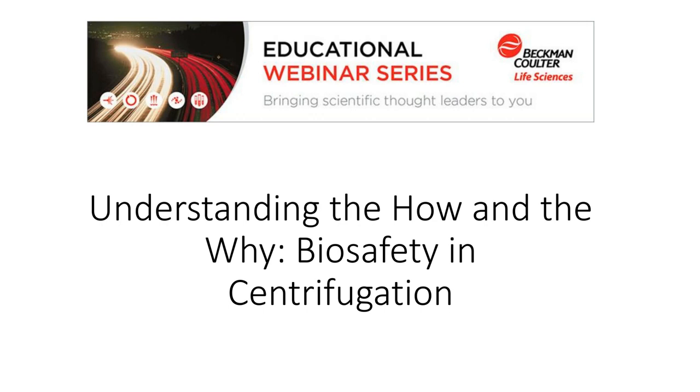That really is a conversation that should be had depending on the types of centrifuges and the types of rotors that you use. As mentioned during the talk, centrifuges range from very low speed benchtop models all the way up to floor model ultra centrifuges. The forces vary greatly. The types of rotors vary greatly. Types of labware vary greatly. So really that's a discussion that should be had between someone like myself or someone within the company and the lab. All right, thank you.